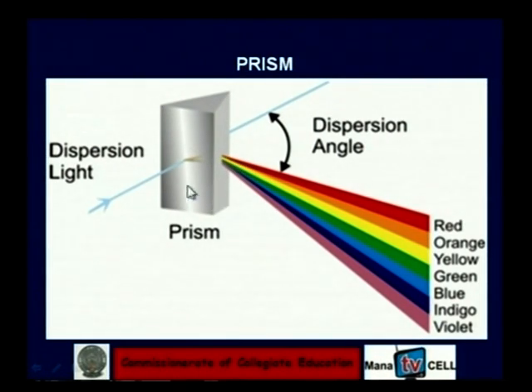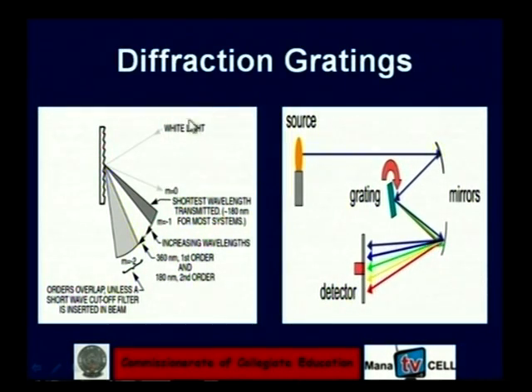When the light is made to focus onto the monochromatic device, that is the prism, it resolves the polychromatic light into monochromatic light and usually exhibits this monochromatic light in a VIBGYOR form. Next, coming to gratings. The surface of the gratings is etched. Here, when the light from the light source hits the sharp-edged surface, it divides the components of light into individual components or individual wavelengths.